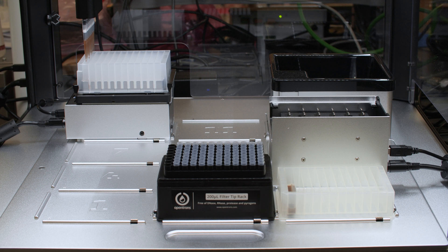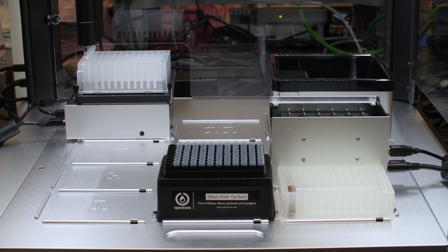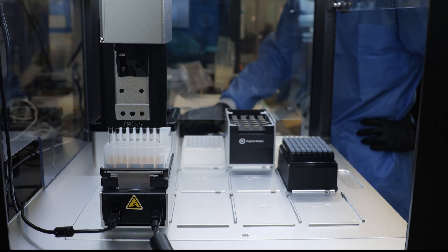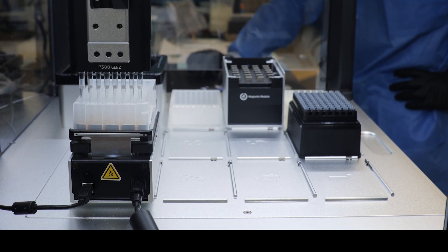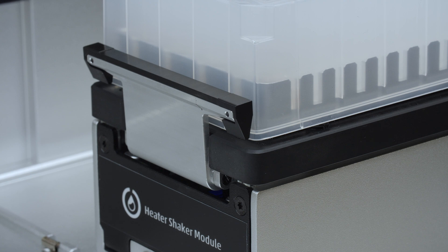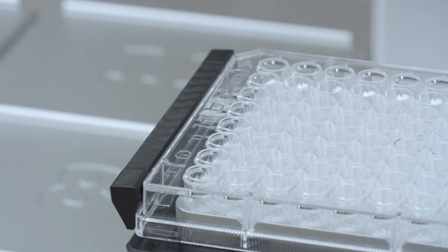The module is designed to only take up one deck slot on the robot, allowing you to maximize your use of space for other modules, labware, and tips. It also has an automated clamping mechanism that locks the plates in quickly and safely, ensuring the safety of your precious samples.